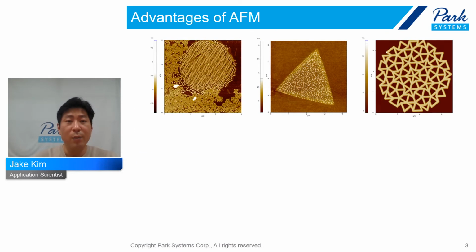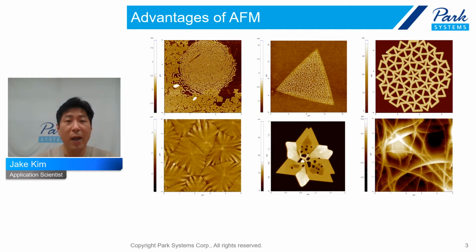As shown in these images, researchers can acquire very detailed topography of nanostructure and accurate probe positioning and distance control in nanometer resolution. Based on those benefits from AFM's practical imaging capability, various applications were developed and enabled many innovative material property characterizations. It directly has led to advances in research and industry with successful prosperity.